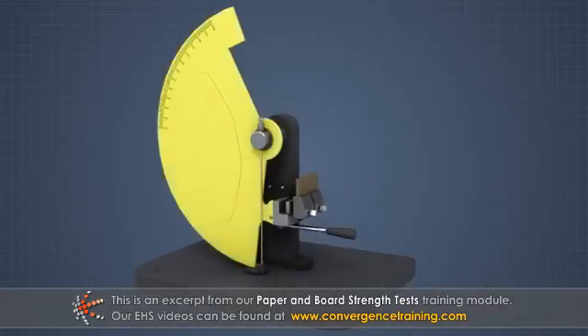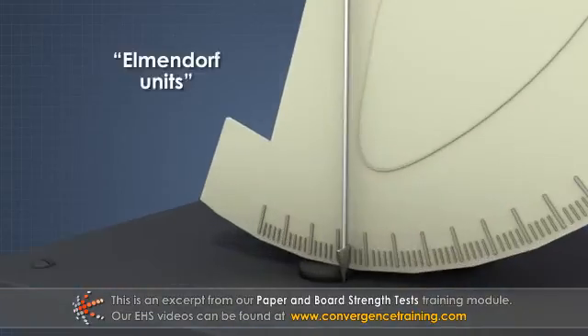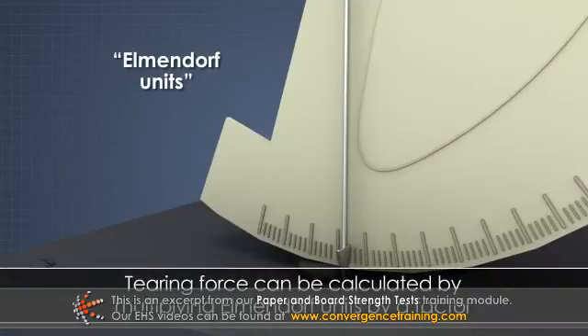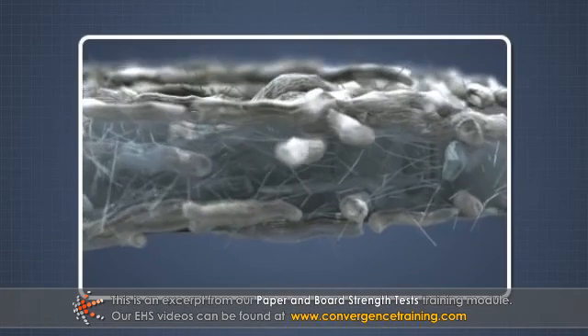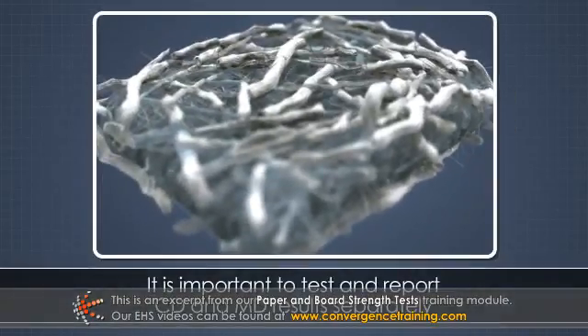A pendulum supporting one clamp is released, and it swings away from the other clamp, registering the force required to continue the tear as Elmendorf units on an arc scale. The tearing force can be calculated by multiplying the Elmendorf units by a factor. Fiber orientation greatly affects tearing resistance, so it is important to test and report CD and MD results separately.